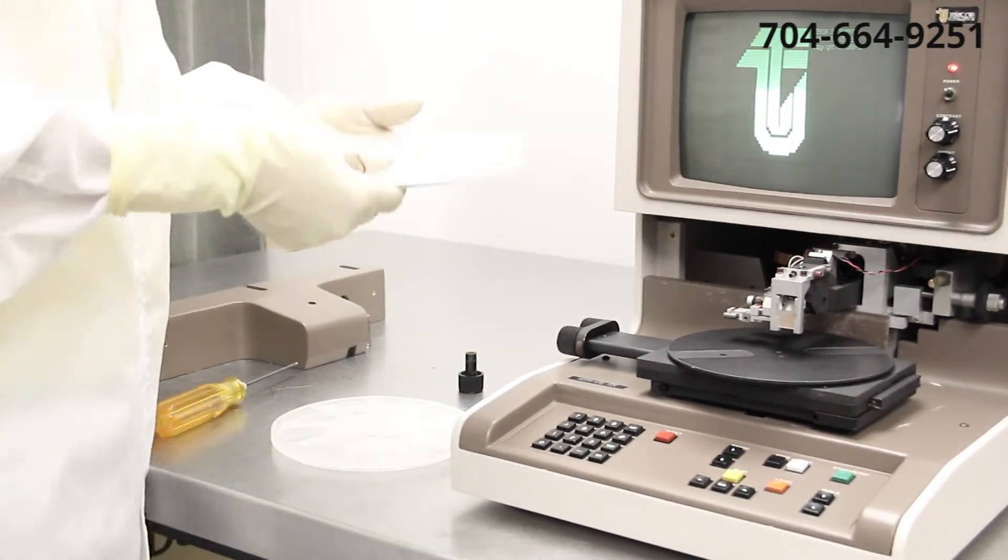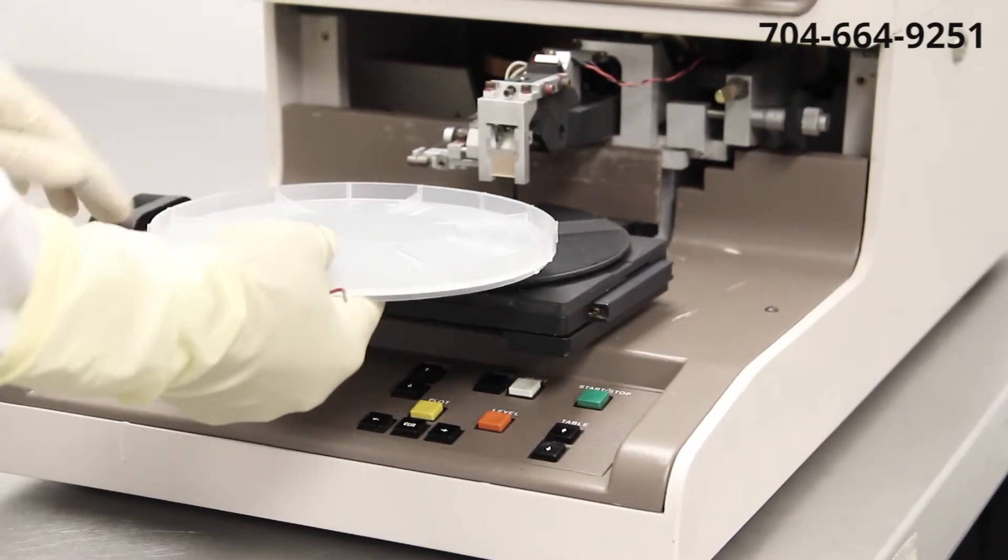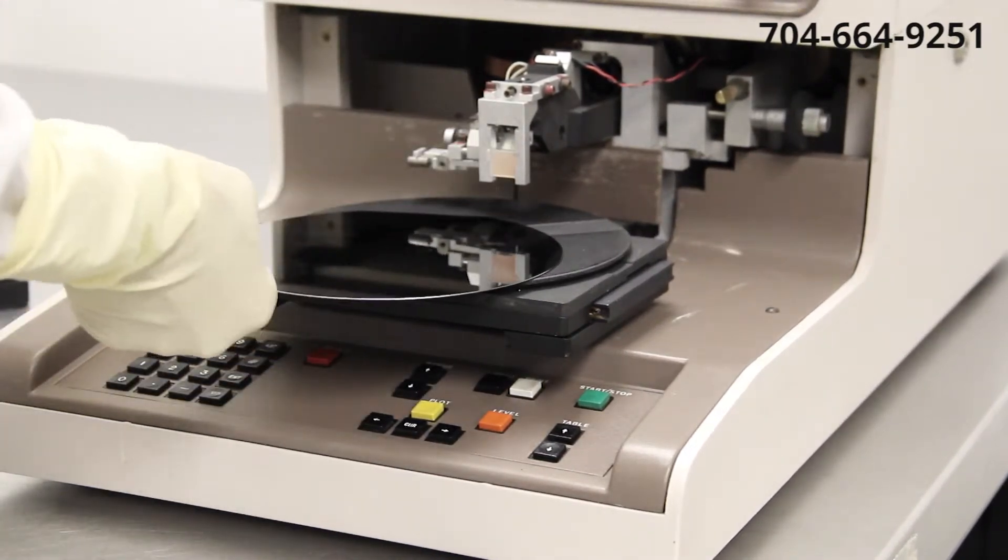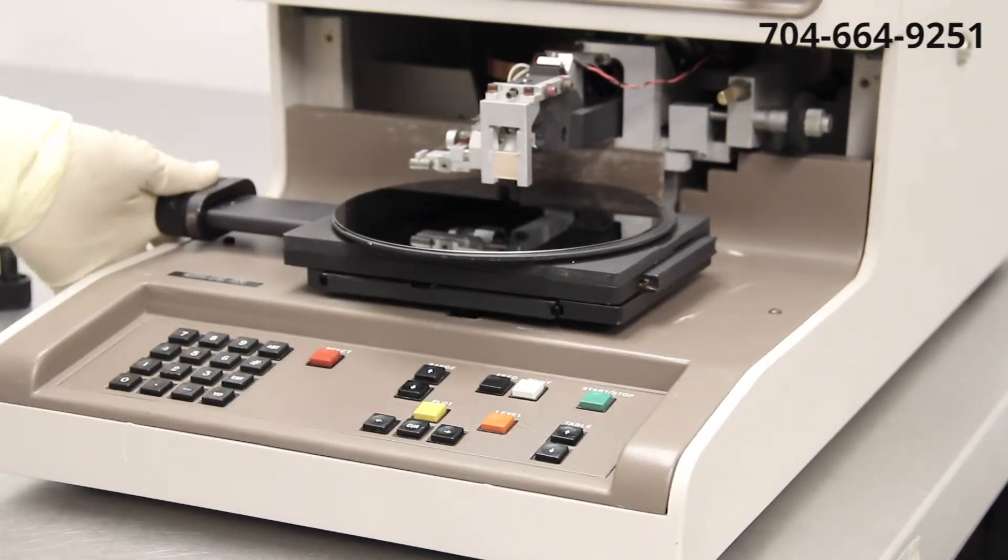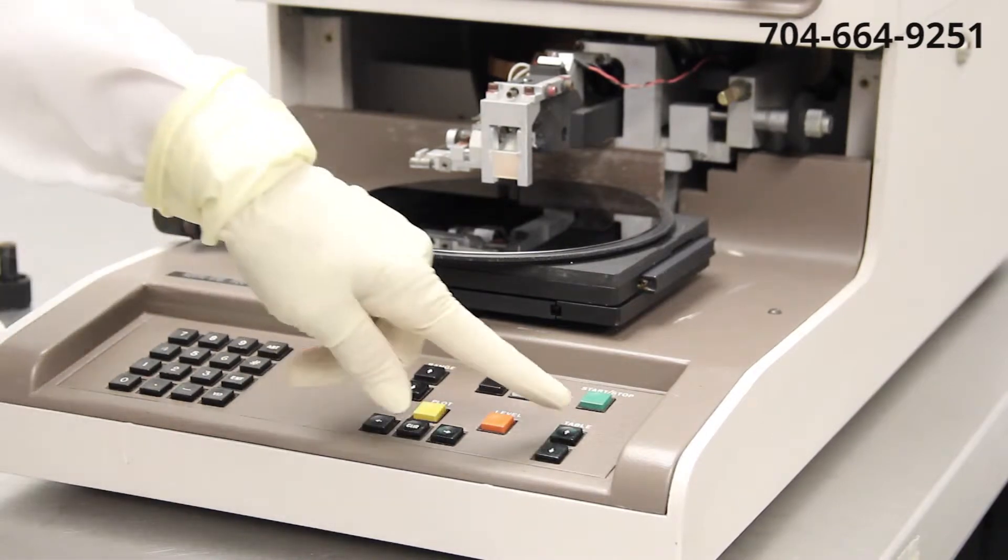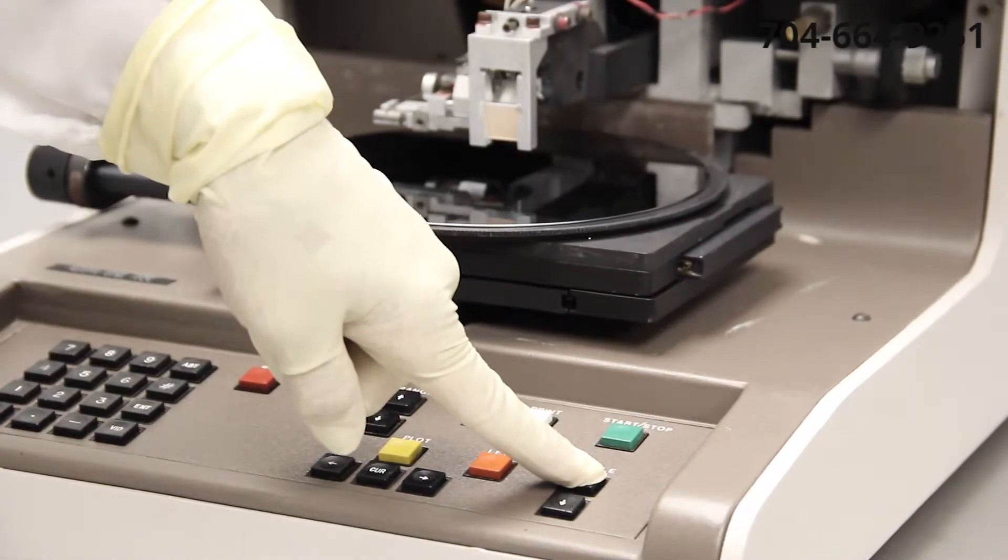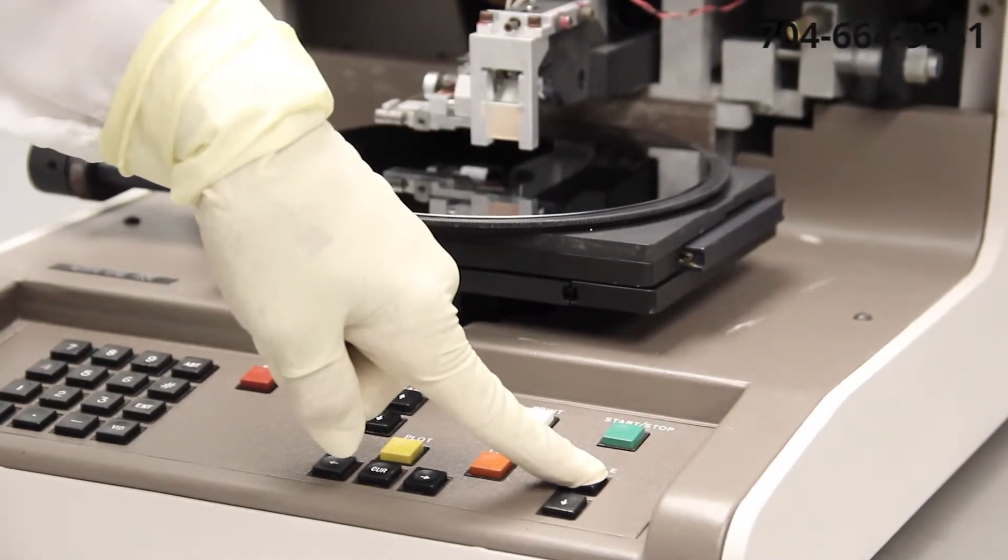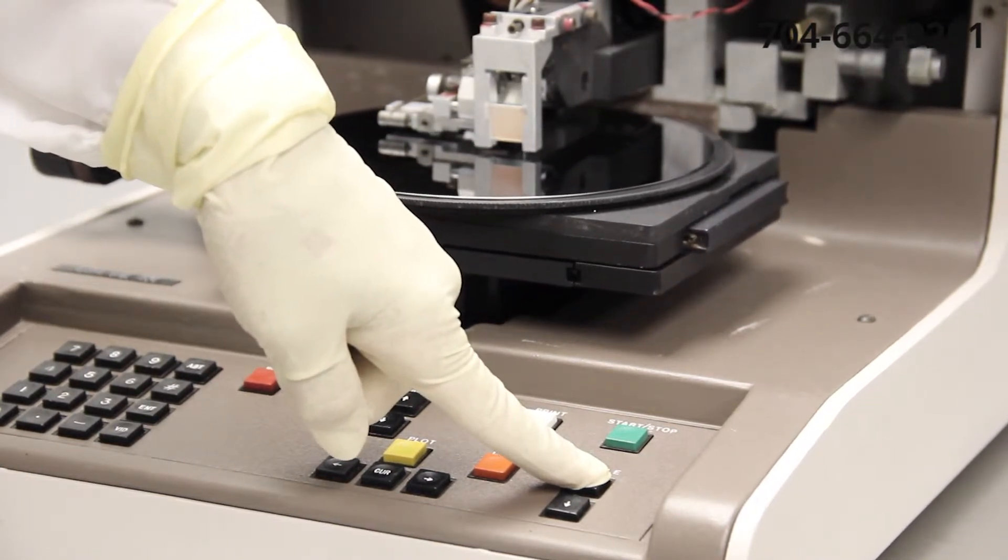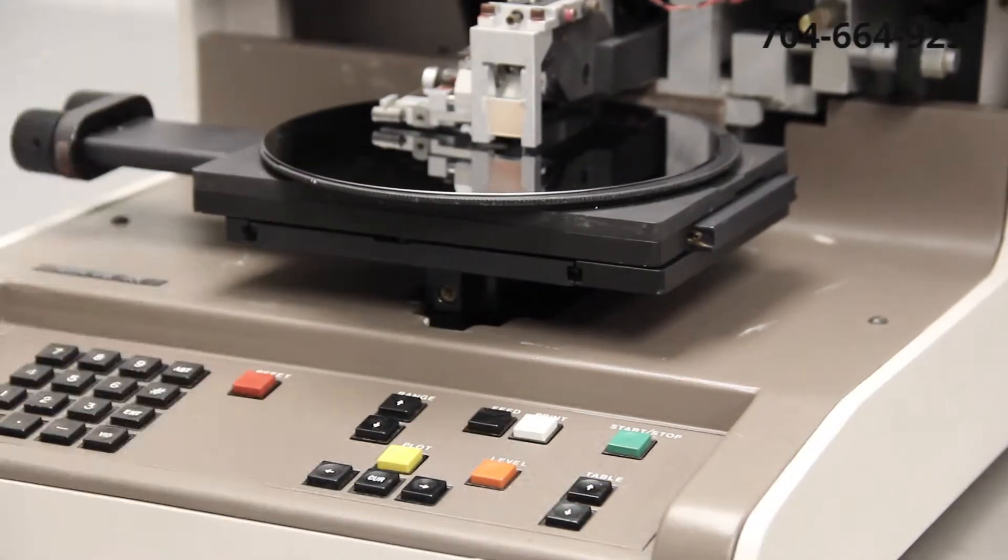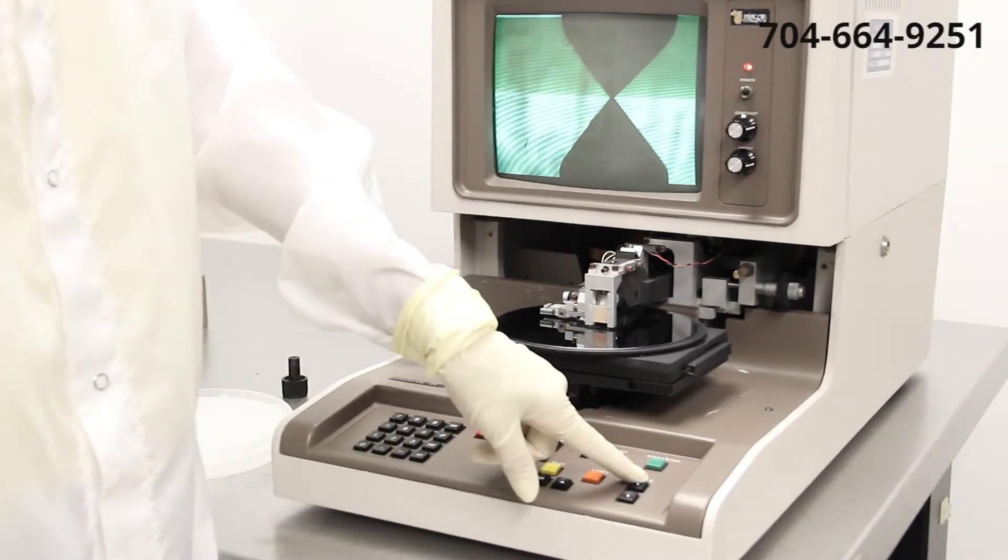I'm going to position the substrate so that it's directly underneath the stylus head tip. I'm going to press and hold the table up button. The stylus head will drop down to a null position and the table will rise. As soon as you can see that the stylus tip has made contact with the substrate and it's normal for it to retract automatically.